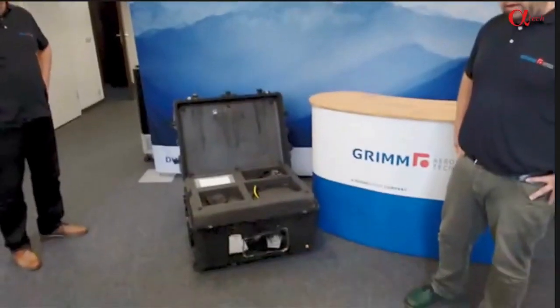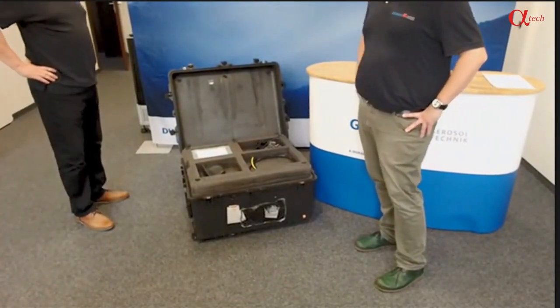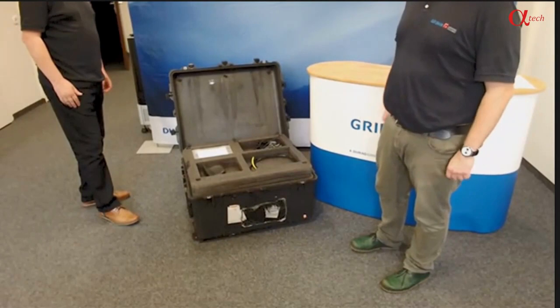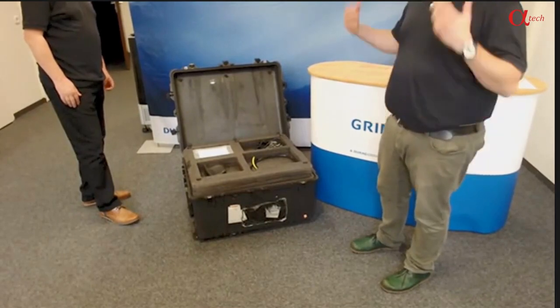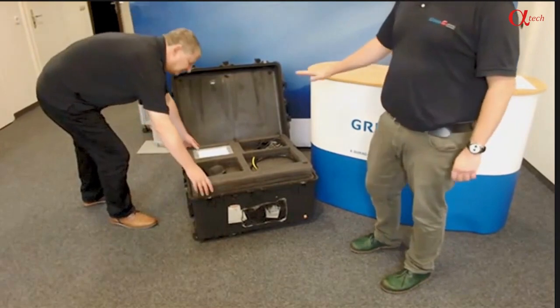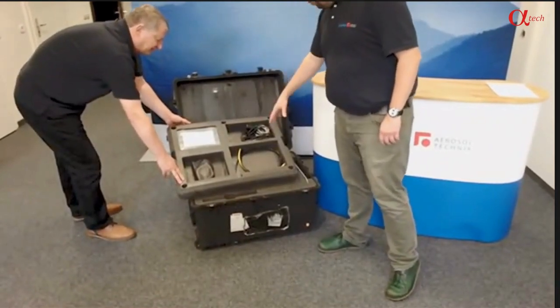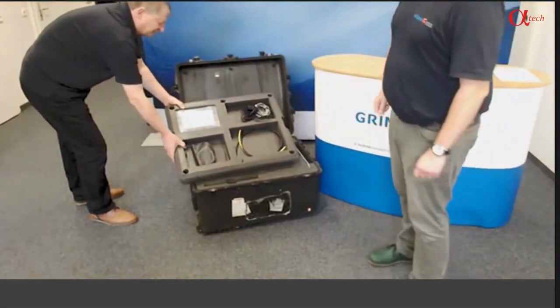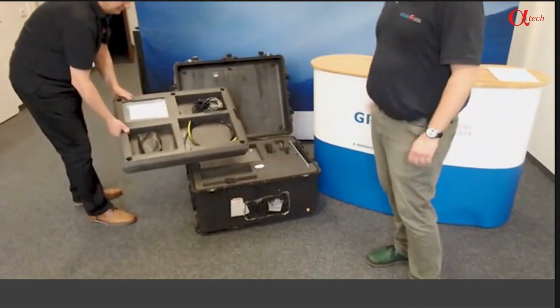First of all, a look at the box that you typically get when you purchase a Grimm SMPS Plus C system. It's delivered in this pedicase where everything is neatly packed, so it's also quite useful for later shipping to your destination of desire, to your measurement site, to your field campaign. It has got several layers. On the top layer there are some accessories, some tubing, all the electrical connections, and also a kit with spare parts and some basic tools to do maintenance on your instruments.